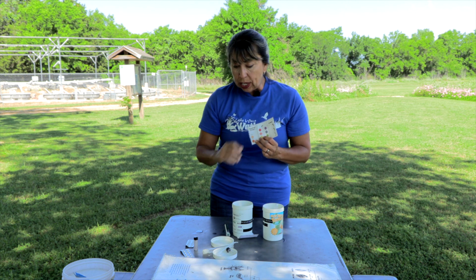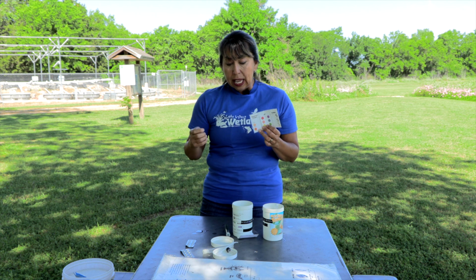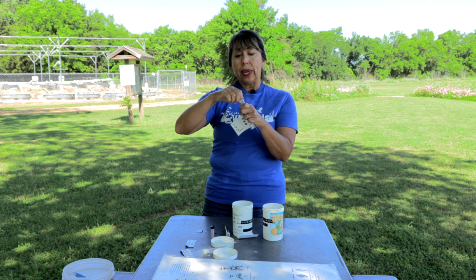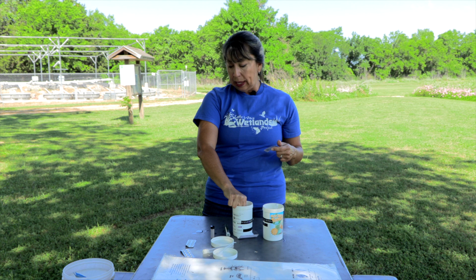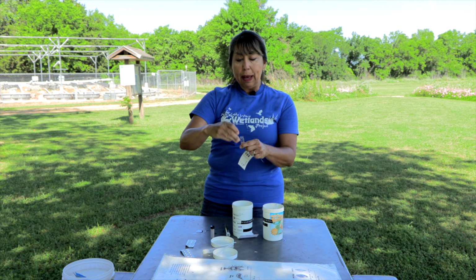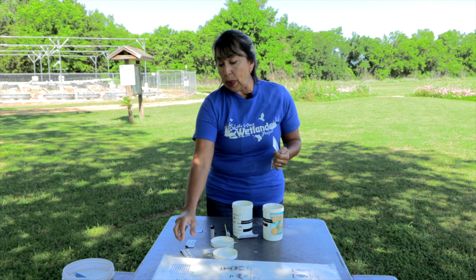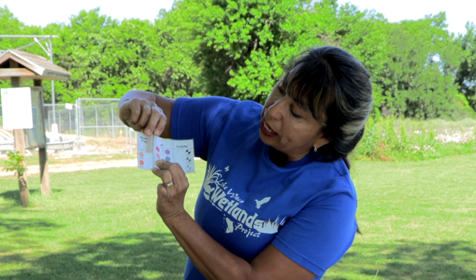So next, what we're going to do is test for dissolved oxygen. We use a little glass vial here. We uncap it, take it with 2 fingers, put it down into our wetland solution, bring it back up, make sure that it doesn't have any air in it already, and then we'll take 2 of the dissolved oxygen tablets and put them in there. I kind of did it for us right in here. And what we do is bring it right over here and see what color it is.